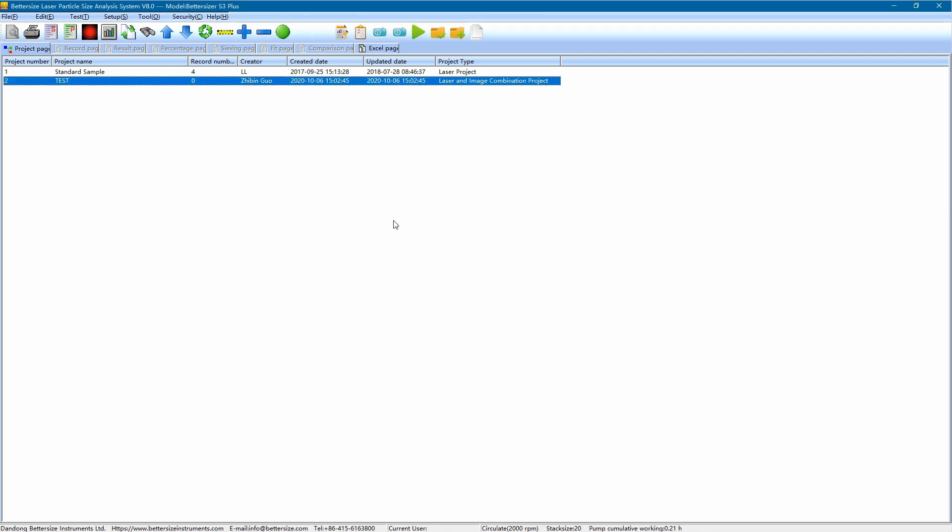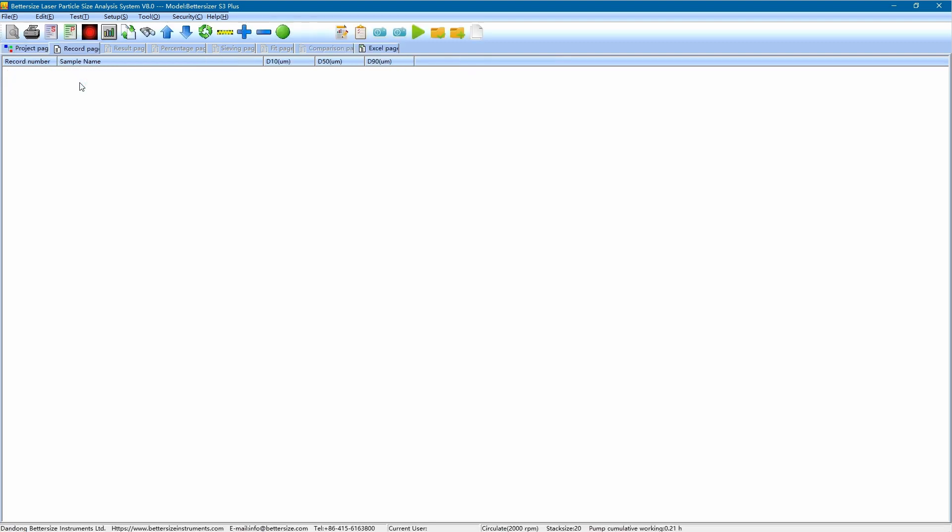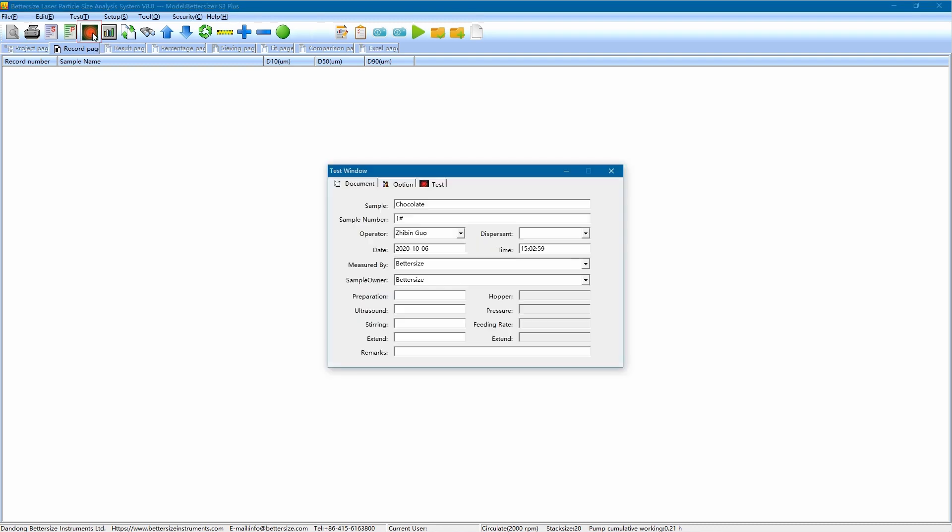Now, this project has been created. We double-click to enter this project. As you see, there's no test data now since it's a new one. Then we can start testing. Click on the test process button, and the test window pops up. Under the document tab, input the original information such as sample name, sample number, medium, measurement time, and so on. This information will be printed in the report finally. Here we enter the sample name as silicon carbide.